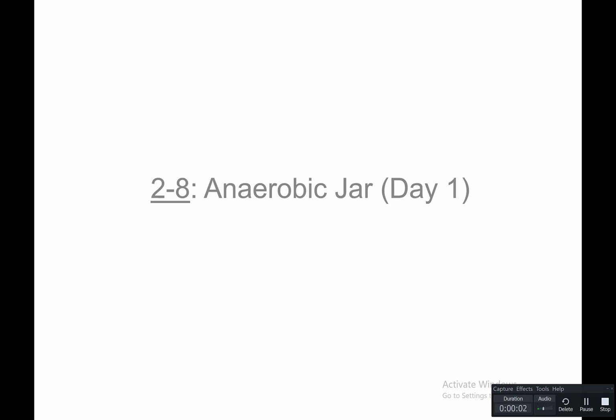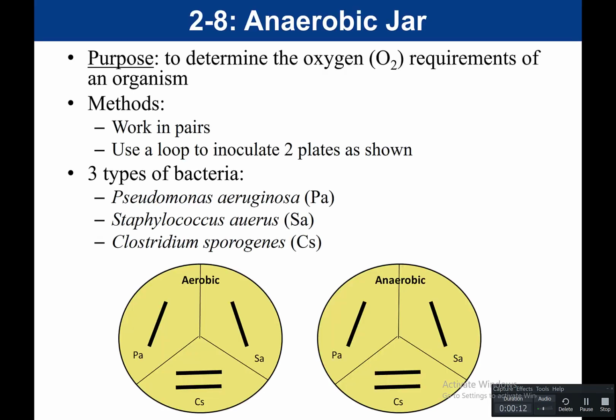So in this experiment, we are going to look at the anaerobic jar. And so this will be day 1, the setup. And this is activity 2-8. So the purpose of the anaerobic jar is to determine the oxygen requirements of an organism.